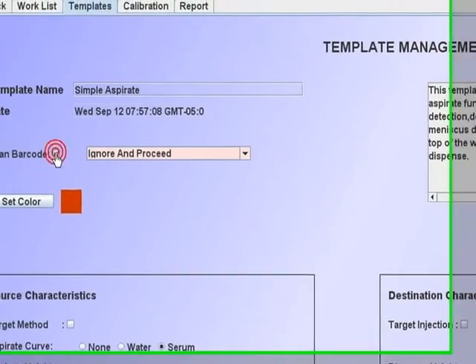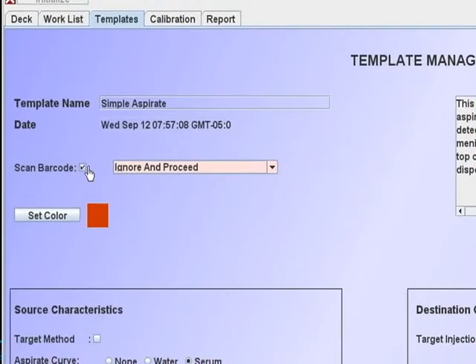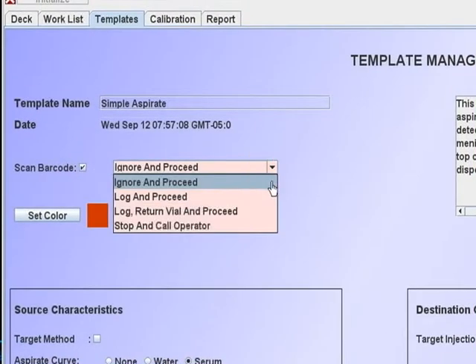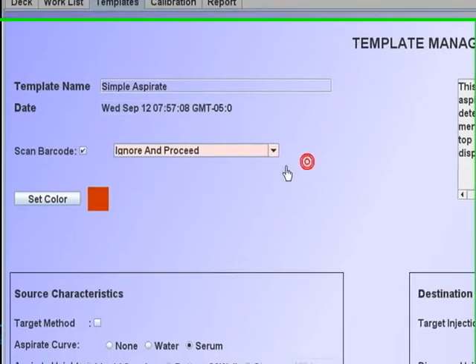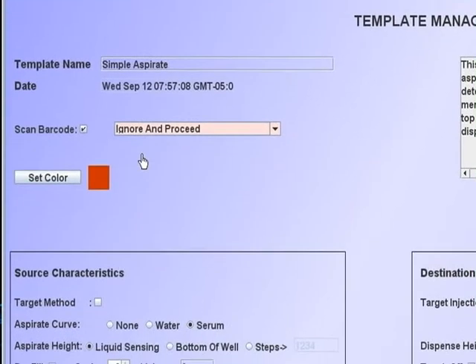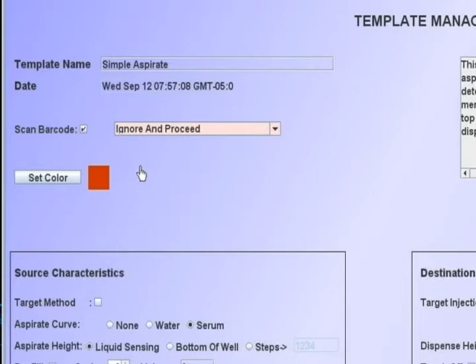The scan barcode is checked if a barcode is to be read with this template. If a program is running by barcodes and the barcode cannot be read, the sample vial is returned to its rack position and the program proceeds. There are several options to define the course of action if the barcode cannot be read.